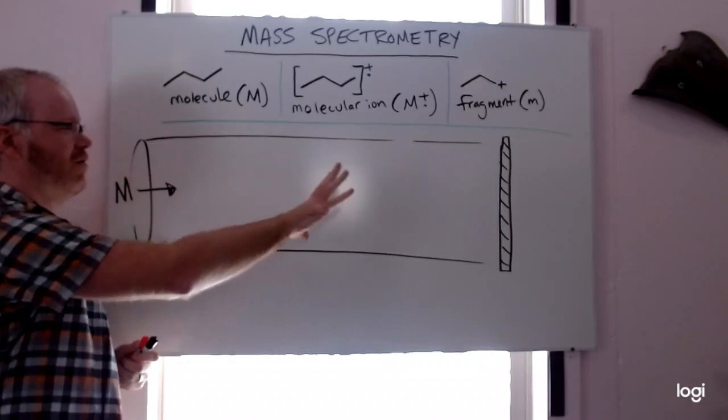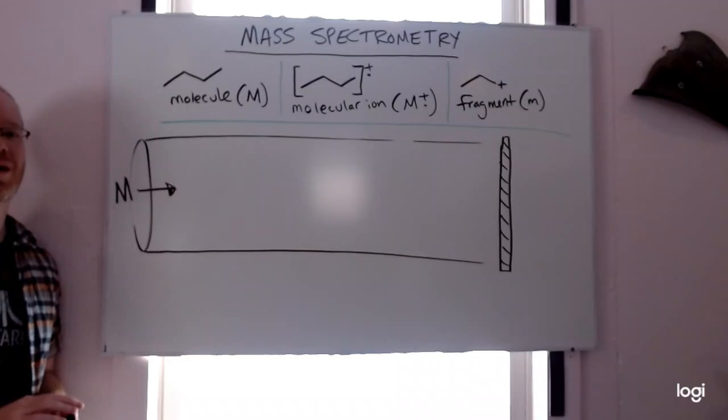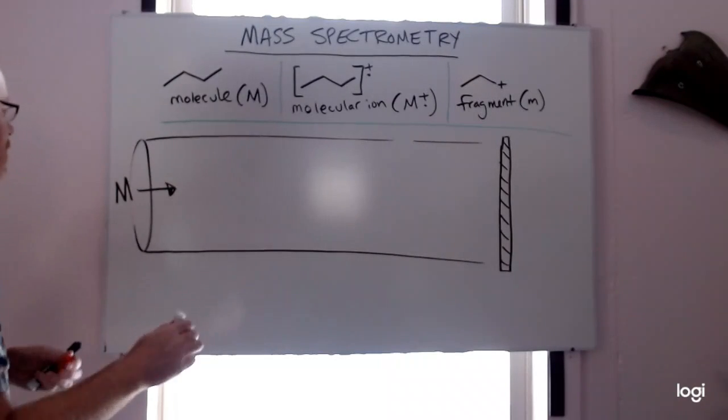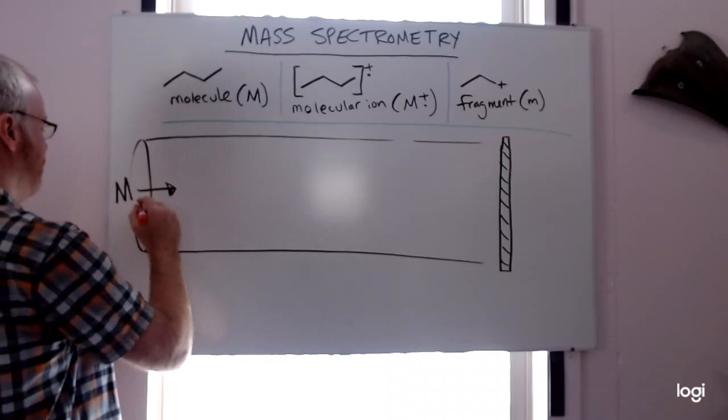So here's my really ridiculously oversimplified mass spectrometer. Better pictures in your textbook, no doubt. But essentially, the sample has to get in there, so the sample's injected.